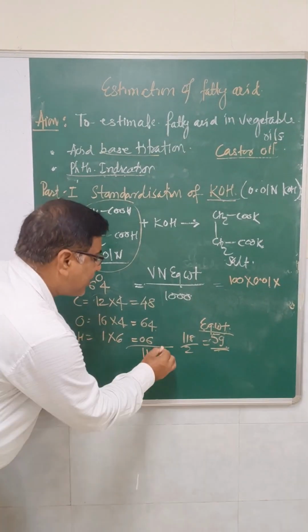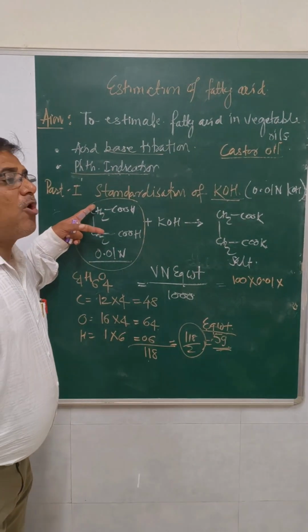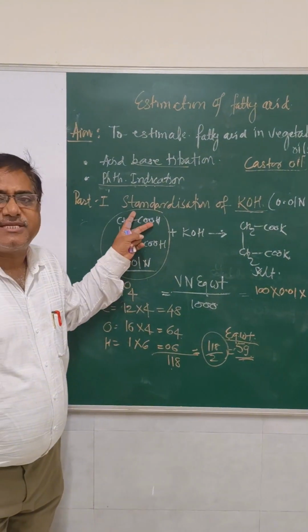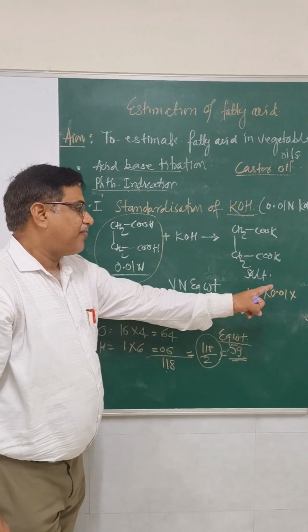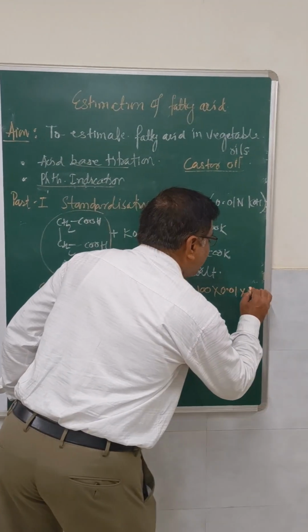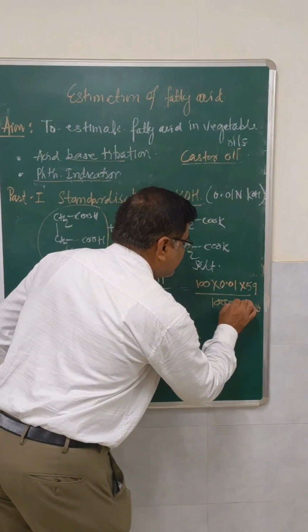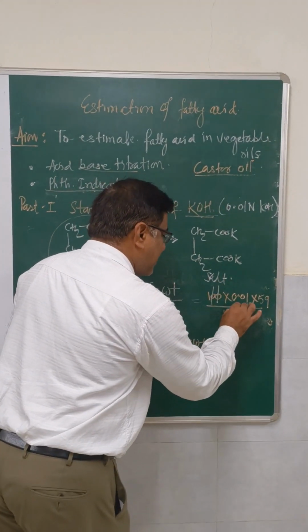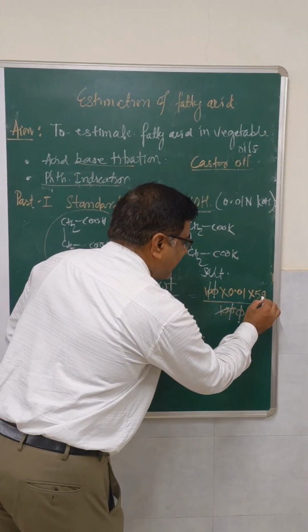हम लोग ने डिवाइड बाय 2 क्यों किया? बिकॉज इट इज द मॉलिक्यूलर वेट. हम लोग को इक्विवेलेंट वेट लेना है. इट इज अ डाइबेसिक एसिड, दैट्स व्हाई डिवाइडेड बाय 2 करना पड़ा हम लोग को. फॉर्मूला में लिखा है इक्विवेलेंट वेट. सो व्हाट आई विल डू हियर, आई विल 59 डिवाइडेड बाय 1000. अभी आपका काम सिंपल है. ये 0 कट, ये 0 कट, ये 0 कट, ये 0 कट. ये भी मैं 10 को करता हूँ. यहाँ पे 5.9 मैं करता हूँ.